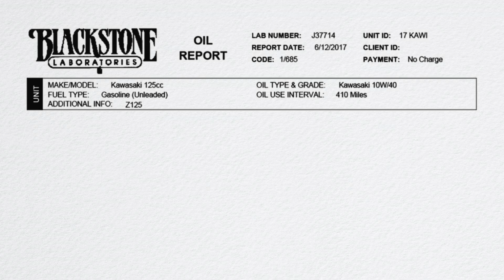They play a crucial role in making sure that we both have all the information necessary to perform a complete analysis, and of course, give you a reference point for your client information down the road. Starting at the top, we have lab number, which is specific to the sample that you sent in. Then moving down, we also have make and model of whatever you sampled, so engine, transmission, etc. We are going to get specific here because the make and model plays a role in averages, but more on that later. We're going to break down fuel type.